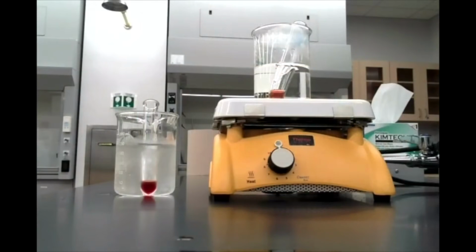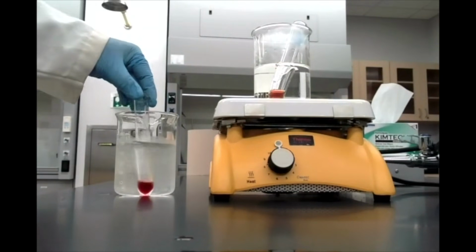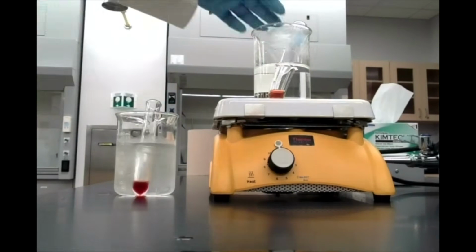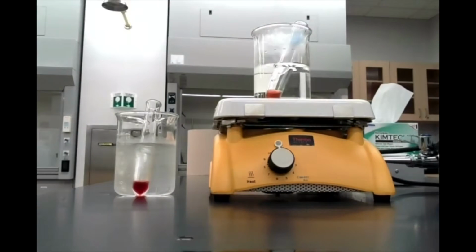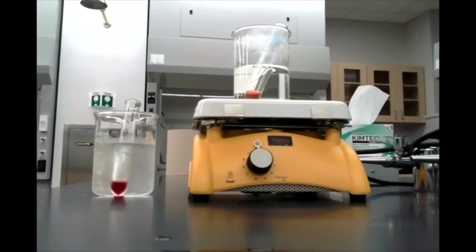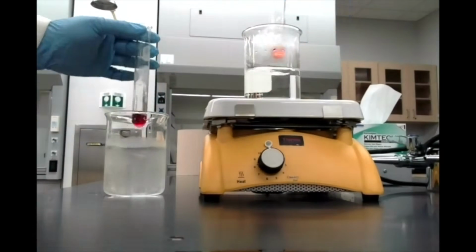Alright, as you can see, I've had my test tube number 5 over here cooling down in an ice bath. Okay, and over here test tube number 6 heating up in our hot water bath. They've been sitting in their respective baths for quite a bit of time. And so hopefully we can observe a little bit of a difference here between them. So let's take the two of those out.